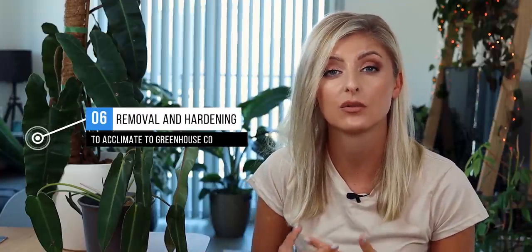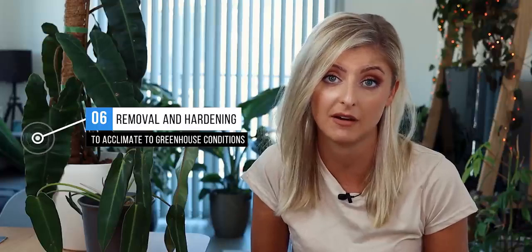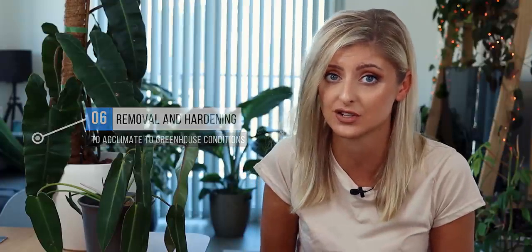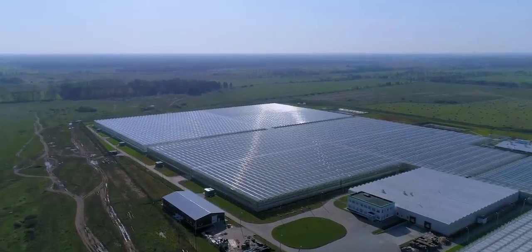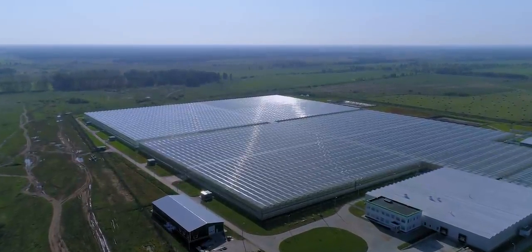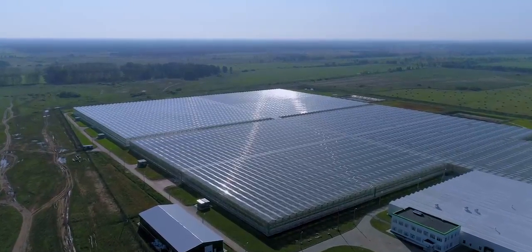Once these roots have developed, the plants are removed, and then they go through a hardening process where they are basically acclimatized to our surroundings, because these plants have actually been grown in lab conditions, not our conditions. Once they're hardened off, of course, these plants will visit a greenhouse, they'll be potted up, and they will be grown out from tiny little plantlets from there on forth. So they're now ready to be grown in a regular nursery and sold on as houseplants.